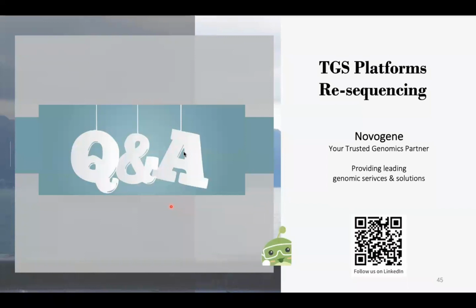Okay, I will wrap it up with the last question. Can 4mC and 5mC methylcytosines be detected with HiFi reads directly? Is there any bioinformatics analysis you provide for this? The answer is yes.